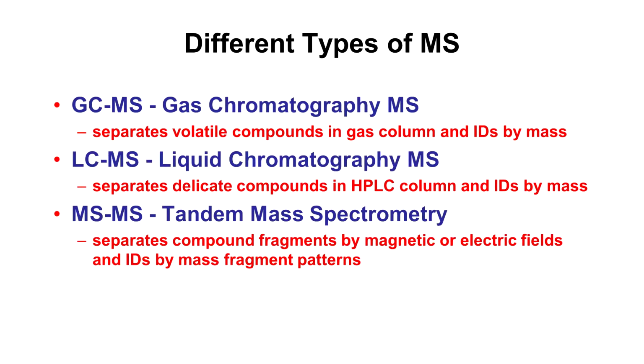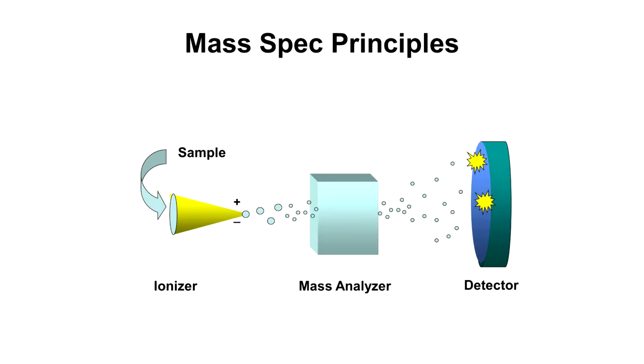And this is an important part of mass spectrometry. And it's actually a very important part of gas chromatography mass spectrometry. Most chromatography mass spec, or even GCMS and MALDI, involve sending something that gets ionized. So in electrospray ionization, it's sent through a nozzle with a strong voltage applied across the ends. It goes through a mass analyzer, which might consist of a magnet or a set of quadrupoles or an ion trap, again, some kind of electrically controlled device, which separates things based on their mass to charge ratio, and then they fly against a detector.